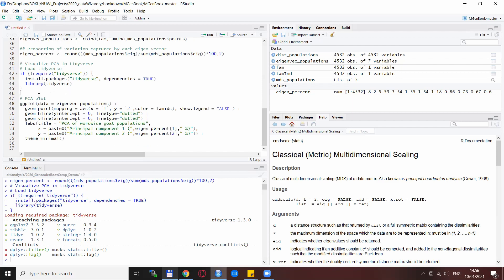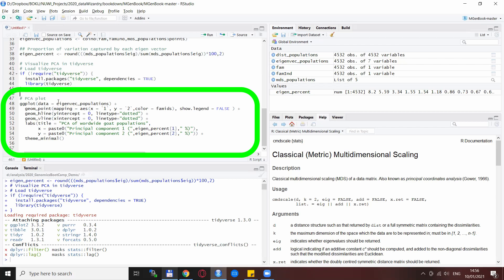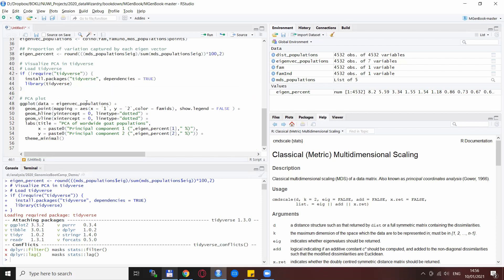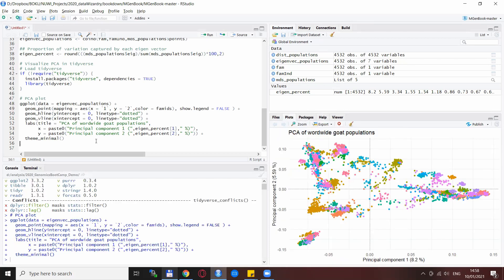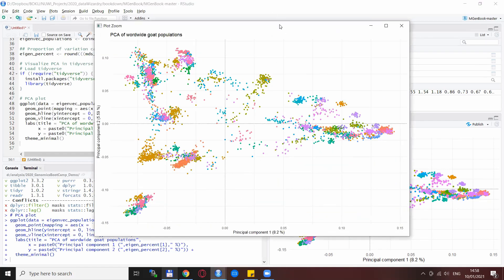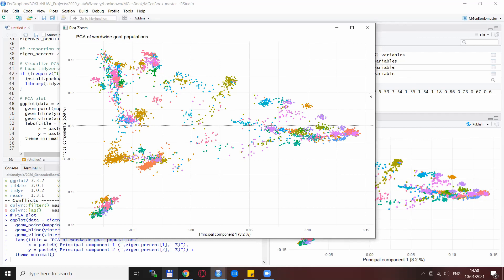Then what we need to do is use the ggplot package on the eigenvector populations data and visualize it as an XY plot as a PCA plot requires. The visualization is quite quick and is automatically shown on the lower right side in the plot panel. This is coming up as a PCA plot, as we can also zoom out. Right now we do not include the legend for this plot because it consists of very many populations — the legend would take up the whole plot since we have hundreds of populations shown here.